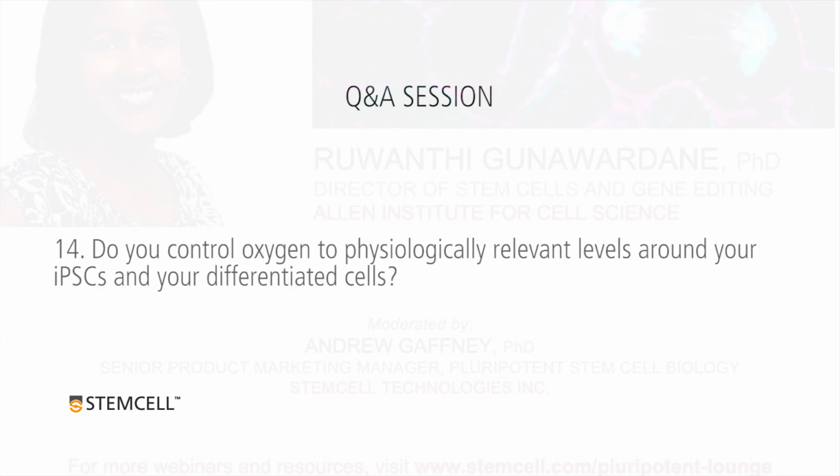Okay, thank you. Do you control oxygen to physiologically relevant levels around your iPSCs and your differentiated cells? Not yet. Some people do use hypoxic conditions for growing the stem cells and especially for neuronal differentiation. But for cardiomyocyte differentiation, most people are not using that. So we have also stayed away from that. But it is an option down the road if we find that that increases consistency, reproducibility. We would love to know that. Nobody has actually told that to us. So we have the option of doing it, but we are currently not doing that.